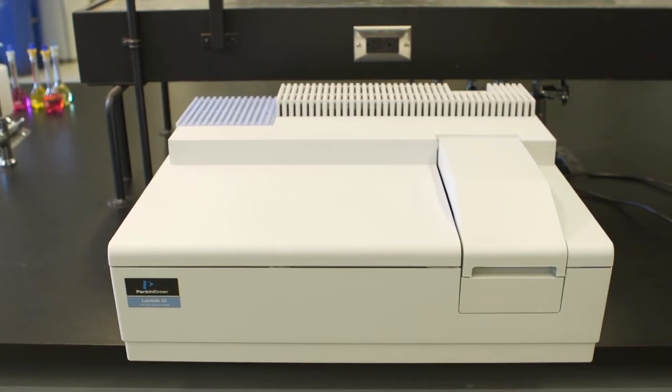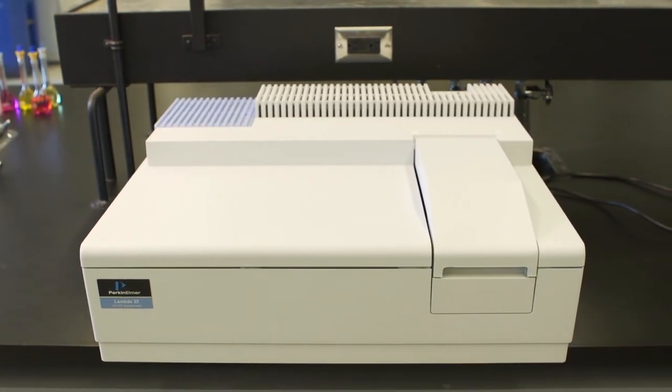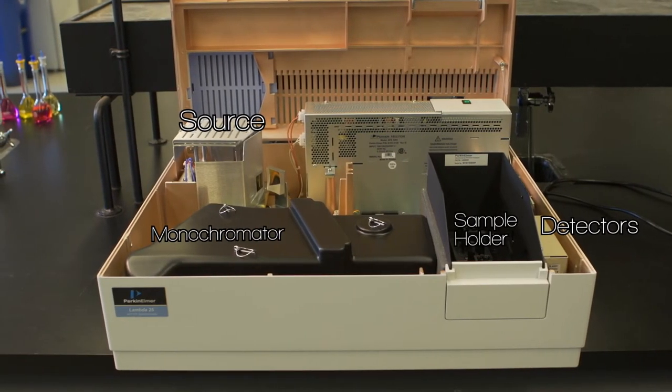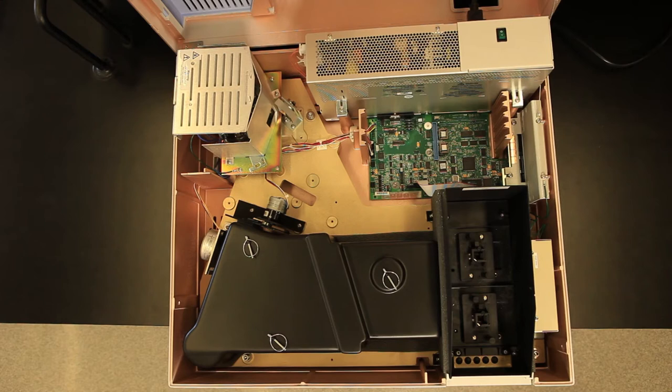We'll first look at the various components of the Lambda-25 spectrophotometer. This is what the instrument looks like when the cover is taken off. We'll start off looking at the light source.